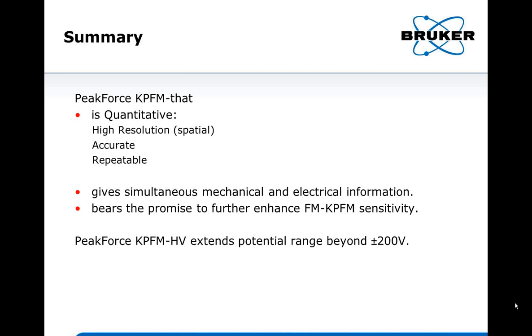If it's close, you are guaranteed there won't be any artifact, because the tip is not touching the surface. If you see the amplitude smaller, let's say by more than 10% of the free air amplitude, you need to lift another 5 nanometers.